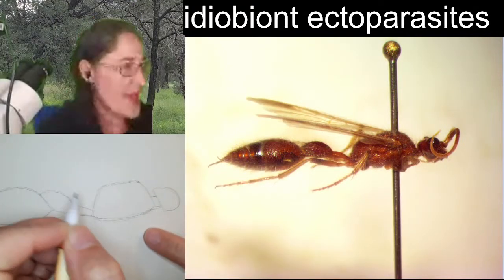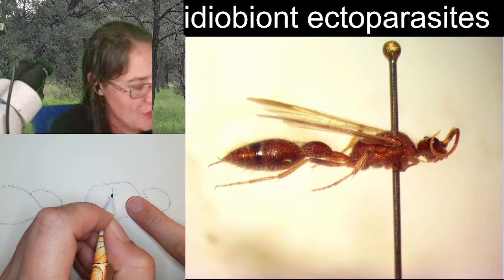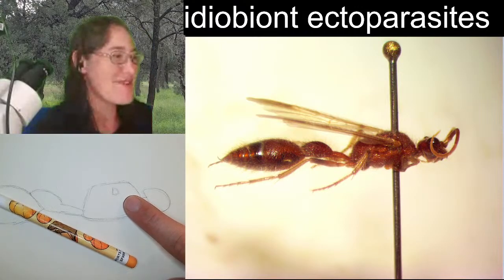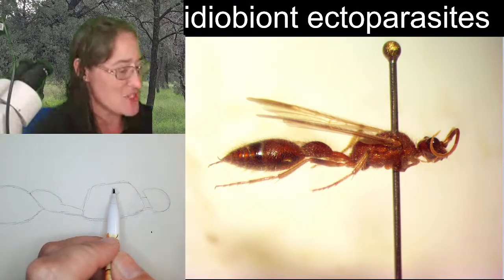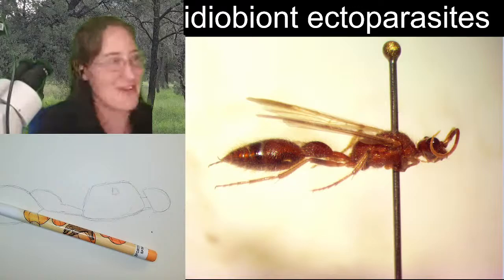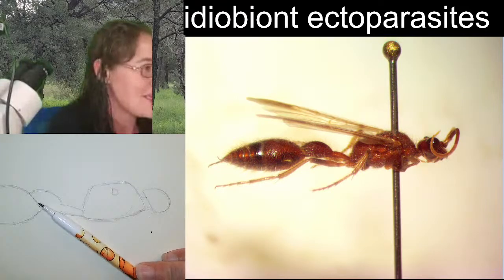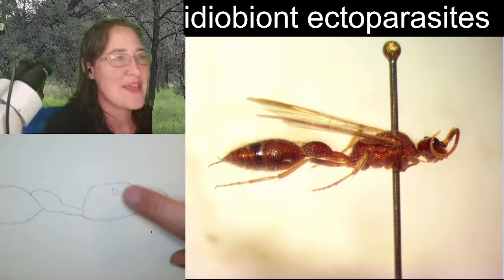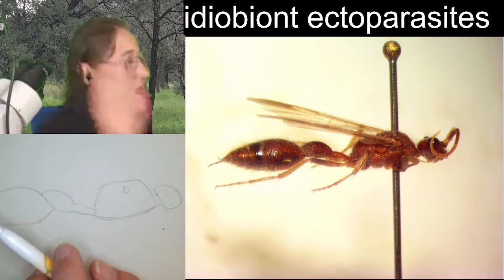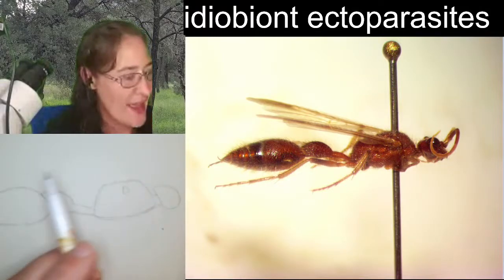Alright, so I do want to add the approximate location where the wings connect, so that's going to be right around here. And look at me remembering the name of this shoulder plate. So I created this little D here. That is the tegula. I believe that is the right word. I think I forget the word tegula every time we teach and I have to remind myself of it. Yes. So that's the tegula, and it's where the wings get connected. It's kind of like a shoulder pad for the wings. It protects all the muscles inside, and it helps us determine where the wings are going to be.